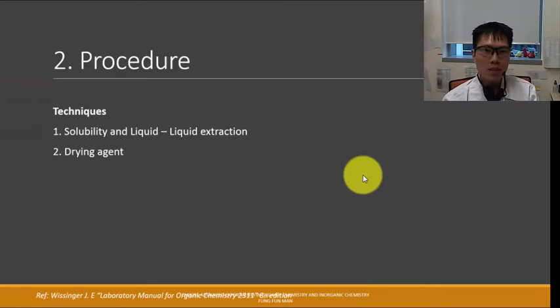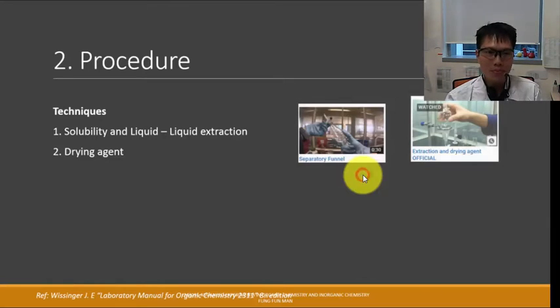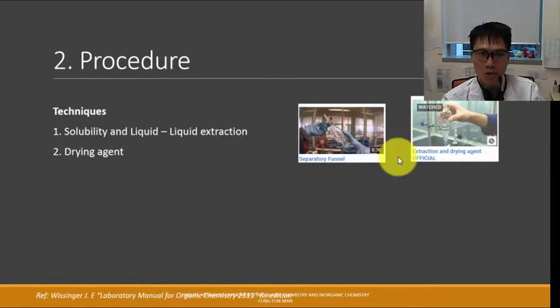Now there are two techniques again we need to revise with you here: liquid extraction and drying agent. You have done this many times in your year 1, year 2, maybe even year 3 before this, but there's no harm going through it again. Revision for you. Hope you have seen this video again to see the proper procedure, the actions you have to take when you are conducting this kind of procedure.